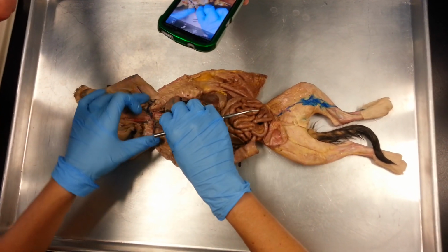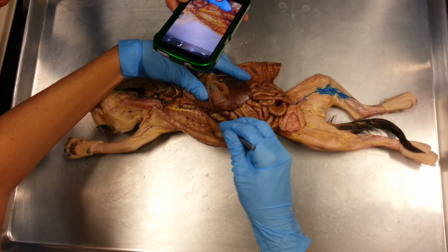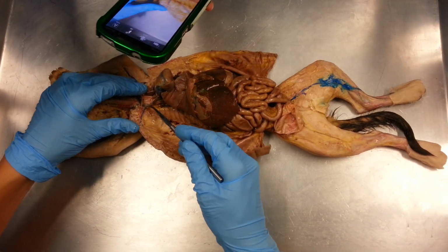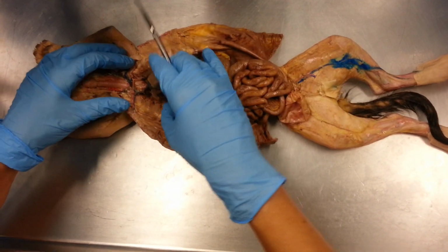Okay, this first split down from the back of the heart is our azygous vein. See the azygous vein? Okay. First split up from the heart, internal mammary, both vein and artery. Okay, going into the rib cage.